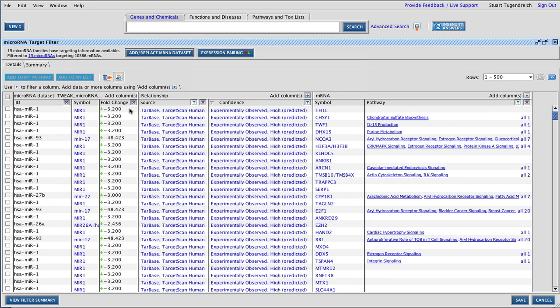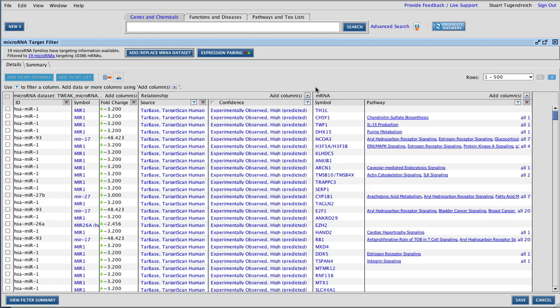Here's an example of the microRNA target filter in action. I have uploaded 19 microRNAs and their expression data, and IPA has automatically returned their experimentally validated targets from TarBase and their predicted targets from TargetScan. There are over 10,000 targets. That's a lot.